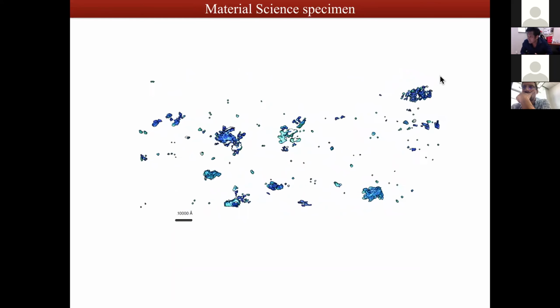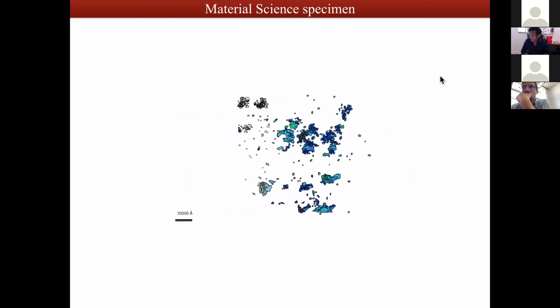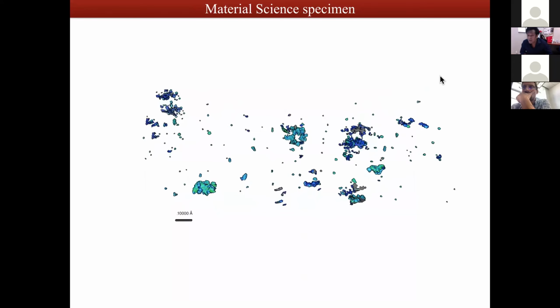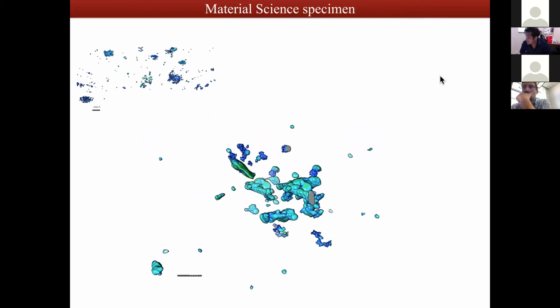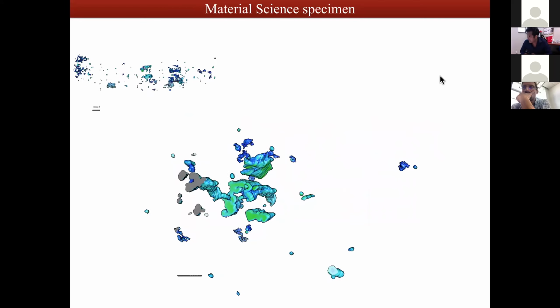We are not sure what these are, but to me, it appears it may be sulfur deposits. Typically, we do find such sulfur deposits in rubber. So we'll want to look into a little bit more detail. This is what a close-up view looks like.